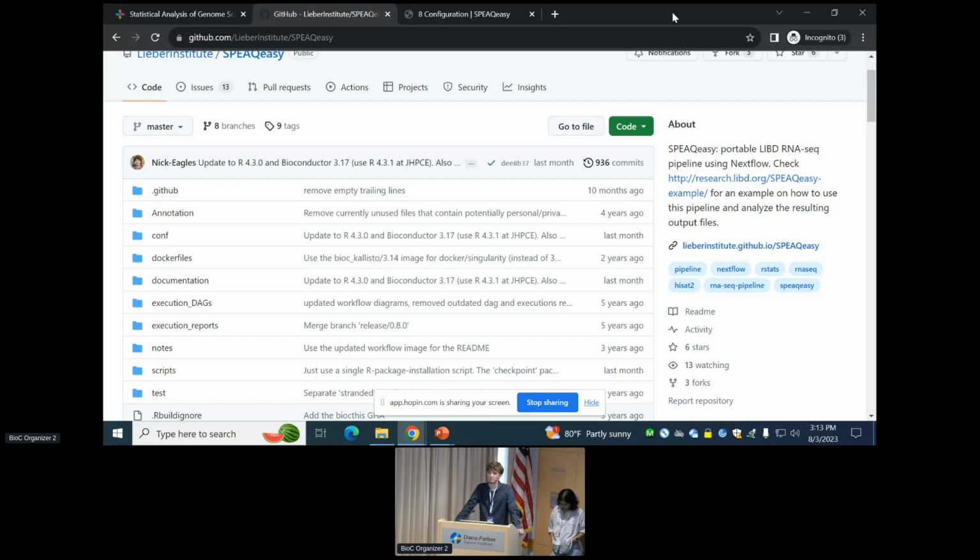I would be surprised if it's different, because it's pretty standard, like STAR and featureCounts and a lot of these other tools: the default feature type is exon, and the default attribute name that you count on is gene_id. Those allow you to change it, but those are the expected defaults. And so I'm wondering, are you just using your defaults, or can you propagate through if you want to change what's being counted on?